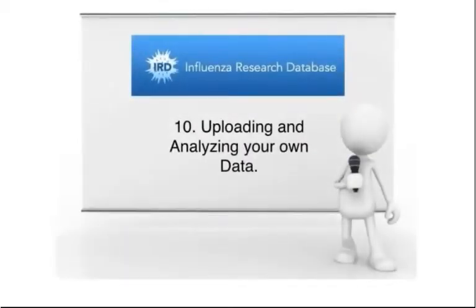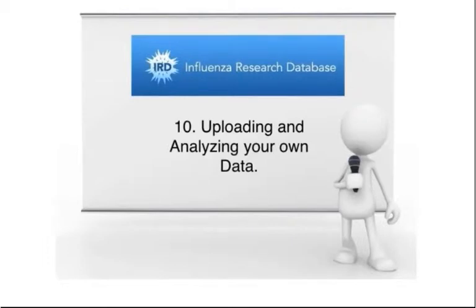Uploading and analyzing your own data. If you have your own data that are not in IRD, you can still use the various IRD analysis tools to analyze it by first uploading the data to your personal workbench.